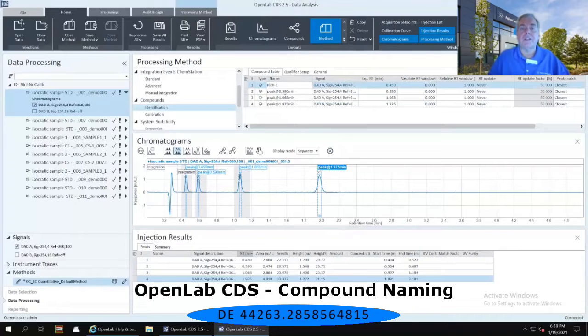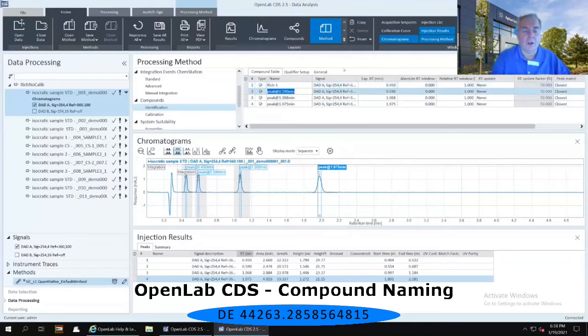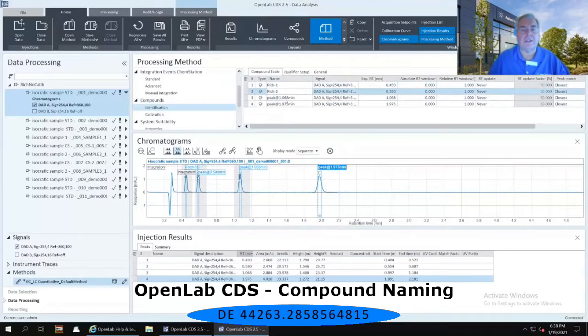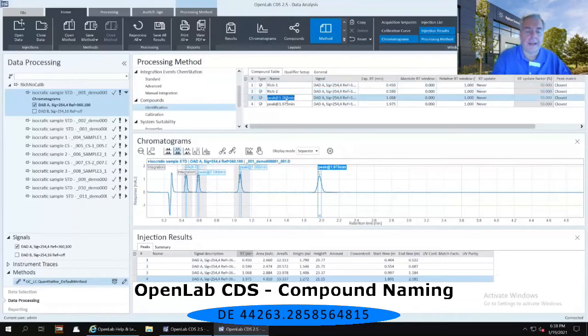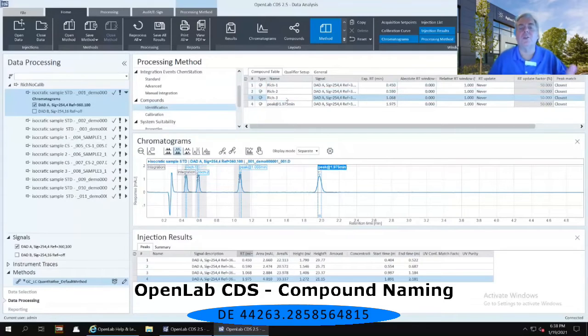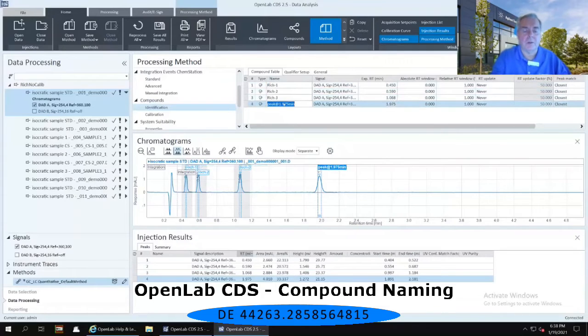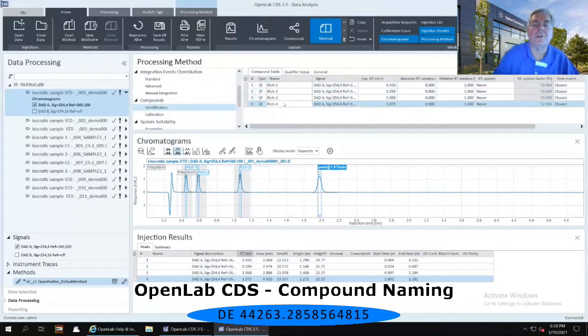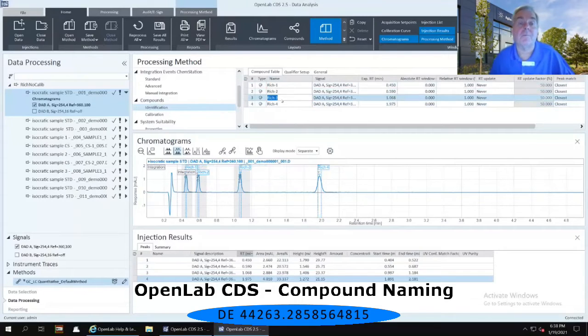For the second one, I'm going to call it Rich-2. Same for Rich-3, and you can be naming yours whatever you want. And as we're typing in these peak names, notice that the peak names are being changed in real time on the chromatogram.